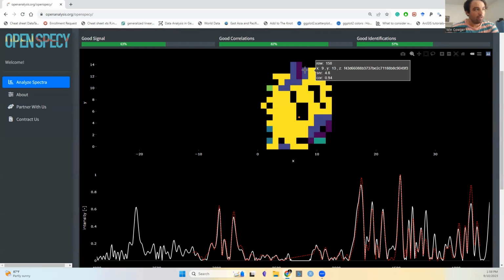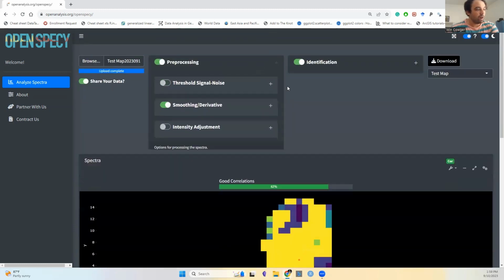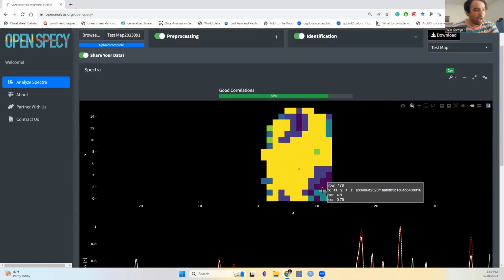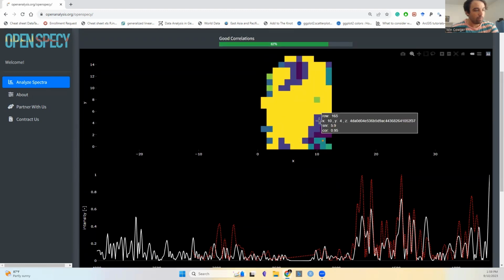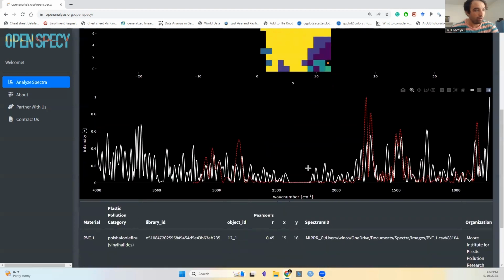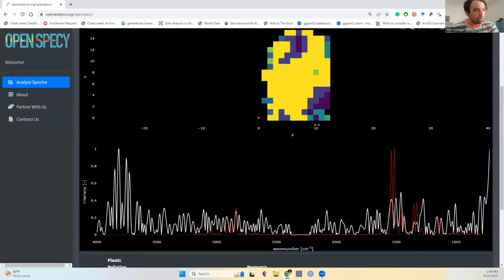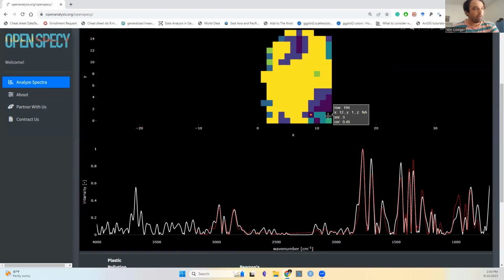I'm seeing that this particle inside of here is really, yeah, there we go. So now let's take a look at this. Yeah, I can still see some signal there. I can still see some signal there. And then here, yeah, less signal. There we go. All right.